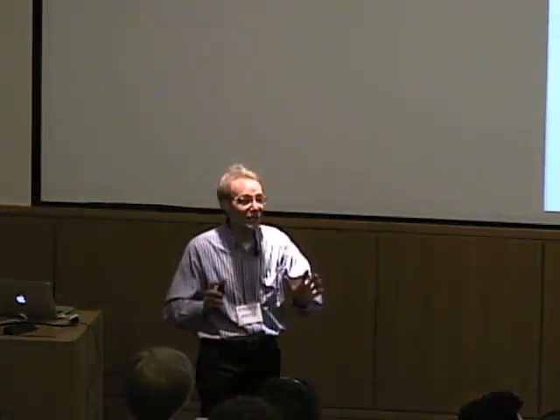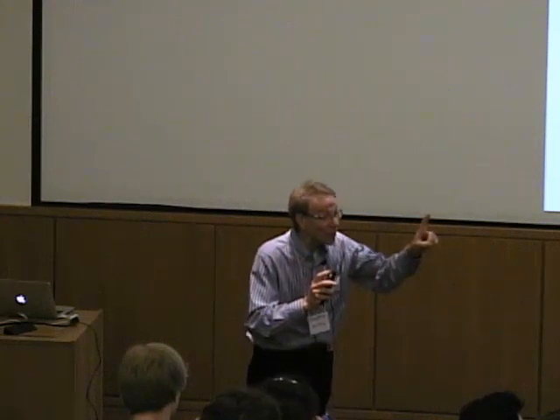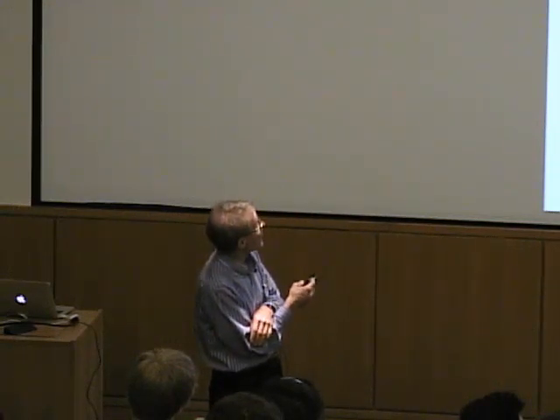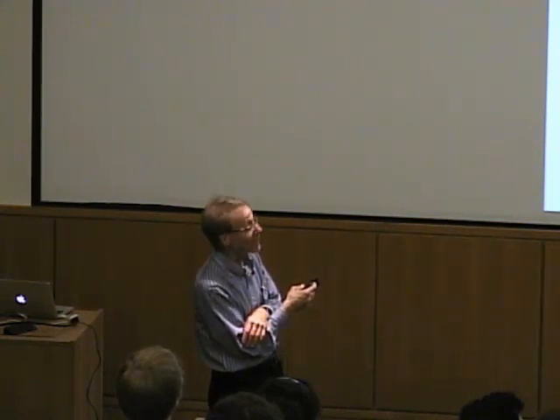Okay? How does that match with what we might expect? Well, it turns out azurin is so well studied, we know the pKa's of the important residues in the apo form, in the copper-2 form, and the copper-1 form. So we can actually make some predictions. So in the apo form, the cysteine is protonated. One of the histidines at the metal site has 0.8 protons.